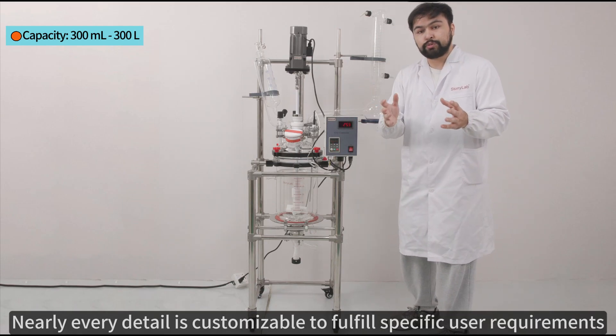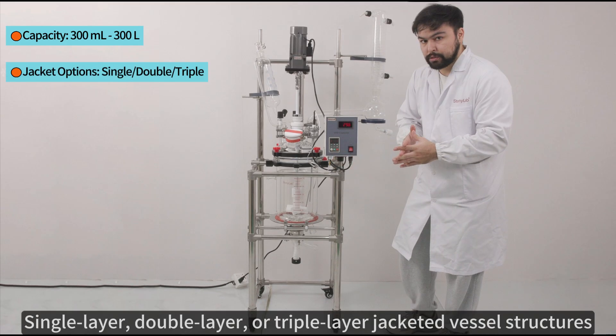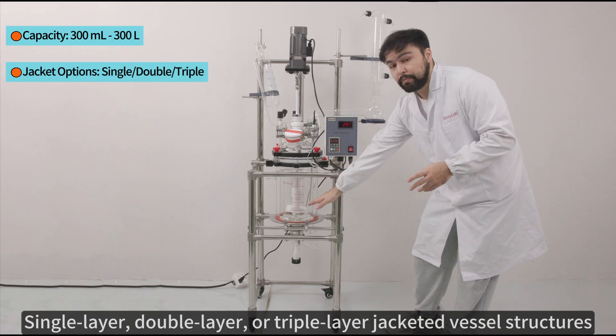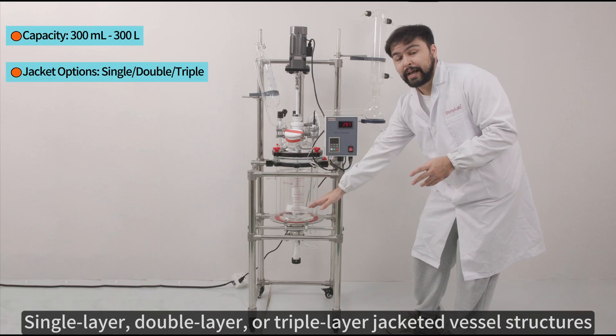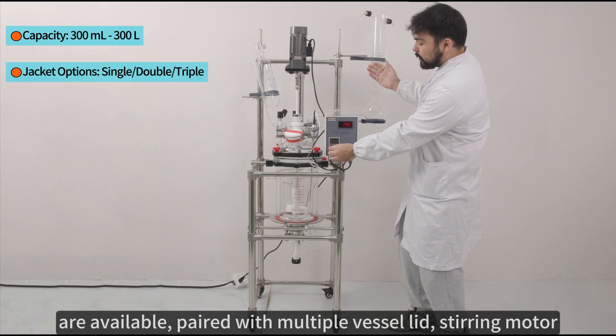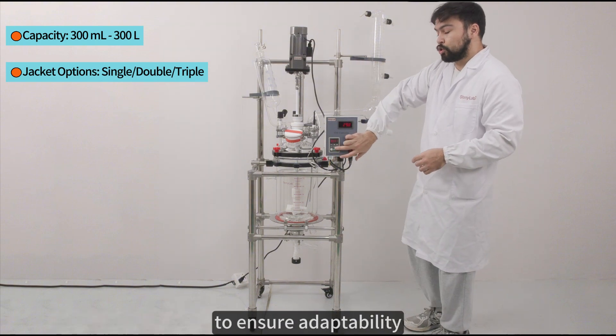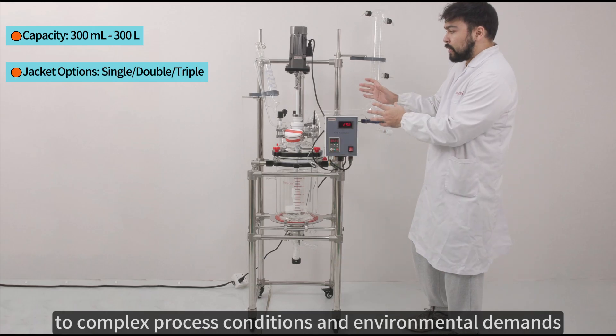Diverse configuration and structure options are available. Single-layer, double-layer, or triple-layer jacket vessel structures are available, paired with multiple vessel lid, stirring motor, and frame material options to ensure adaptability to complex process conditions and environmental demands.